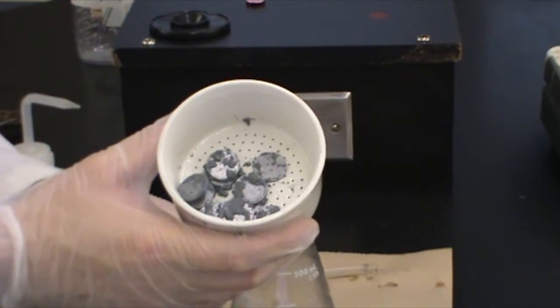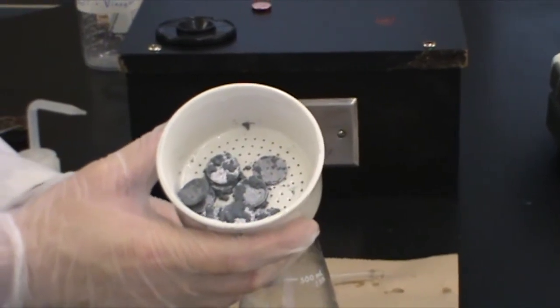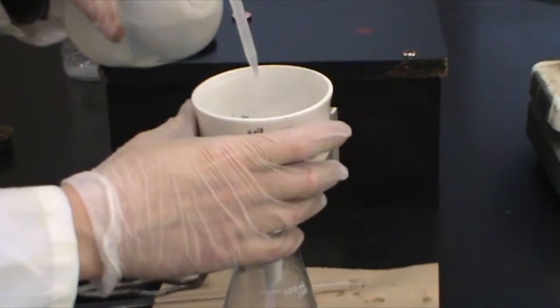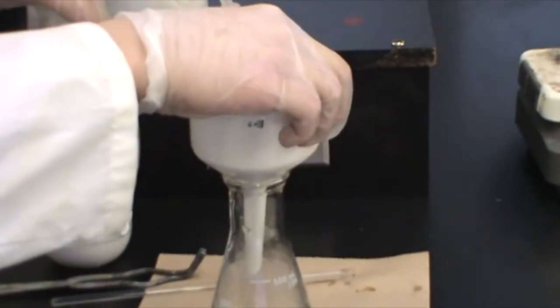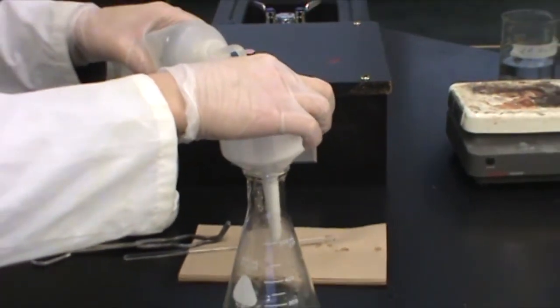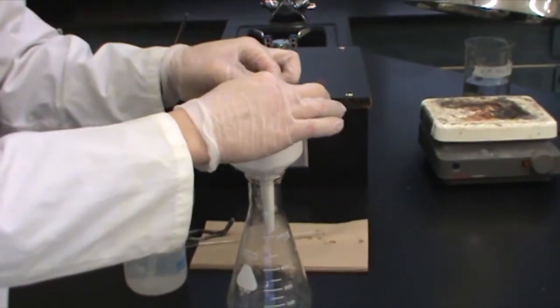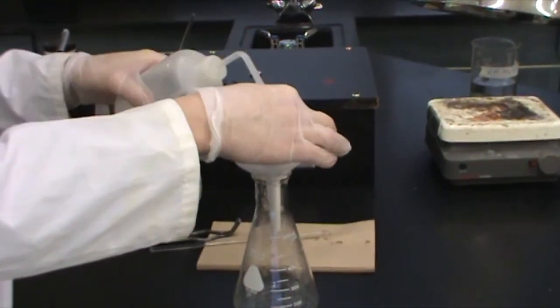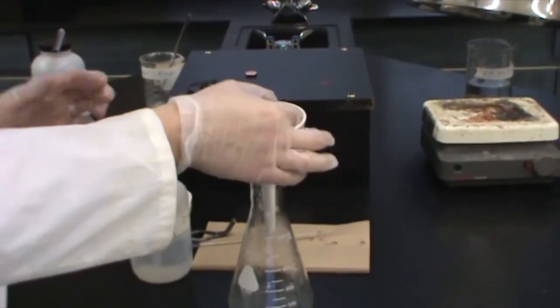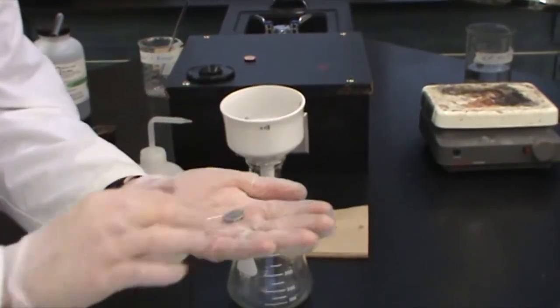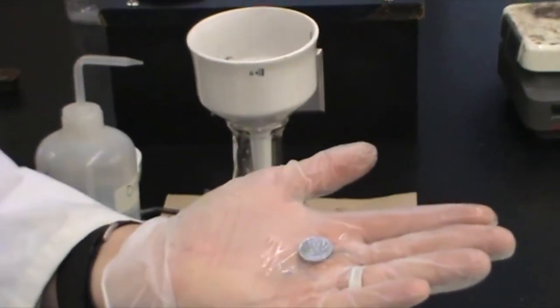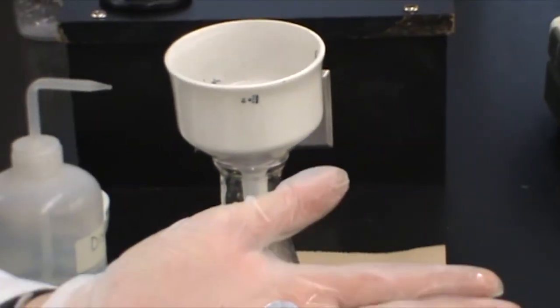Now we'll wash the excess zinc off the pennies. As you can see, the zinc coating makes the pennies look silver.